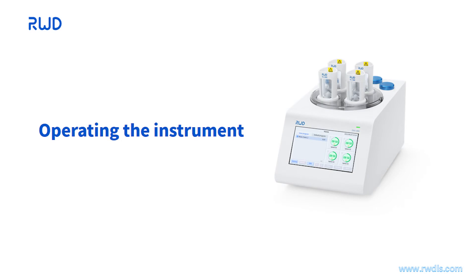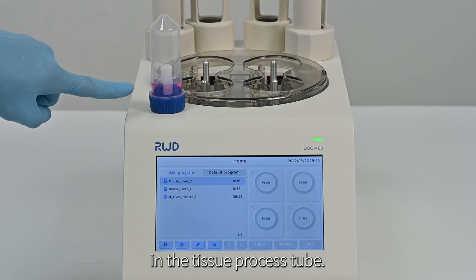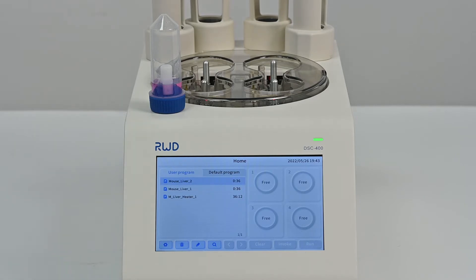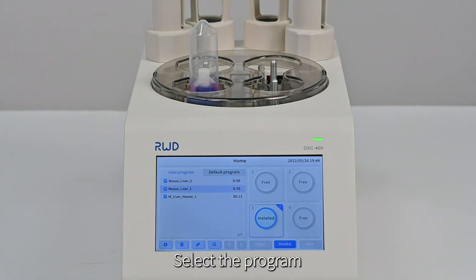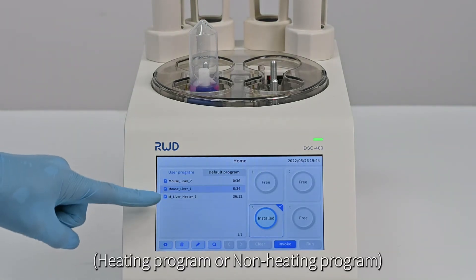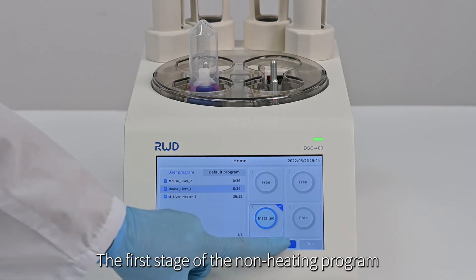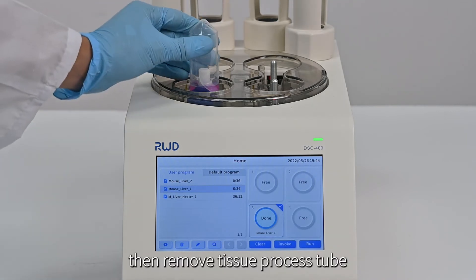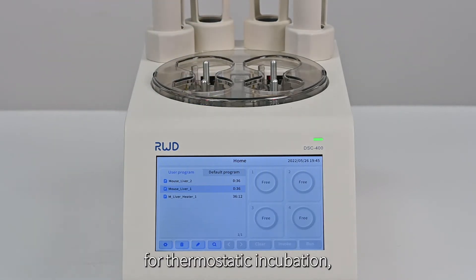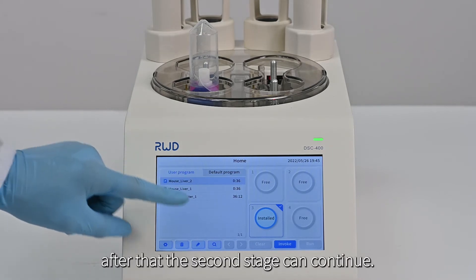Operating the Instrument. Prepare the tissue and enzymatic reagent in the tissue process tube. Place the tissue process tube in the bushing and select the program — heating or non-heating. For the non-heating program, the first stage must be run first, then remove the tissue process tube for thermostatic incubation, after which the second stage can continue.